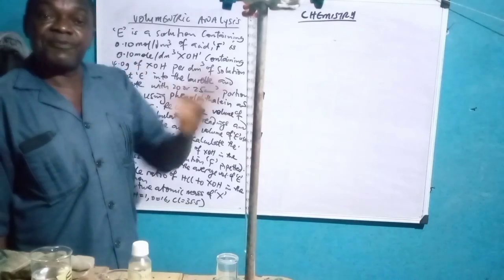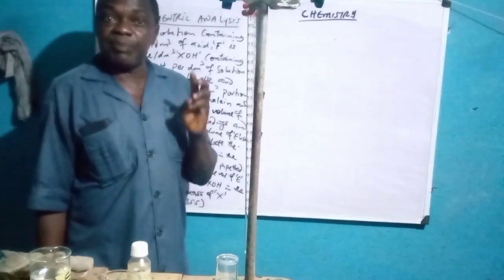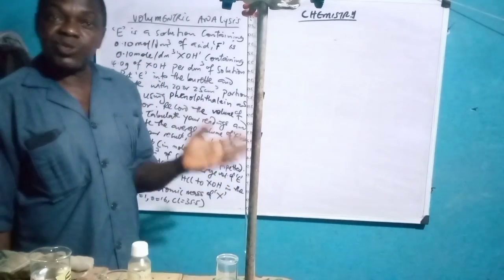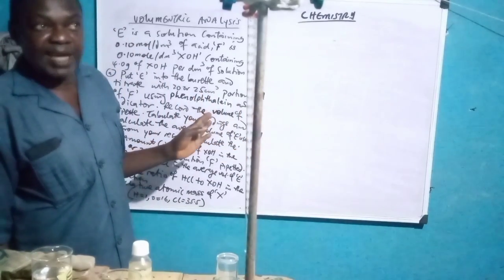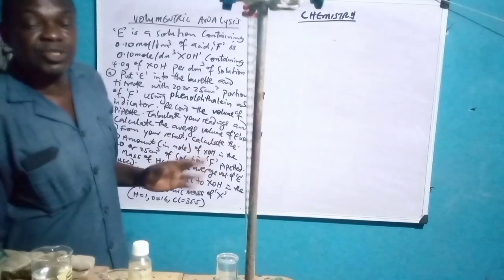So you can see a difference, because the indicator normally used in secondary school is either methyl orange or phenolphthalein, and they can bring any one for you. I believe you have been looking at the one with methyl orange. So have a look at how phenolphthalein will look, so that in case they give you phenolphthalein in the coming WAEC, it will not be strange to you.